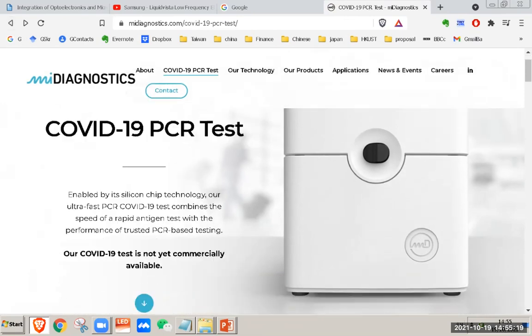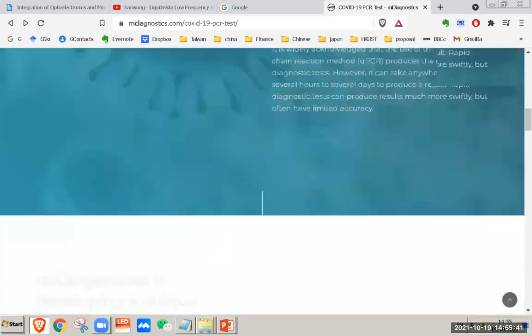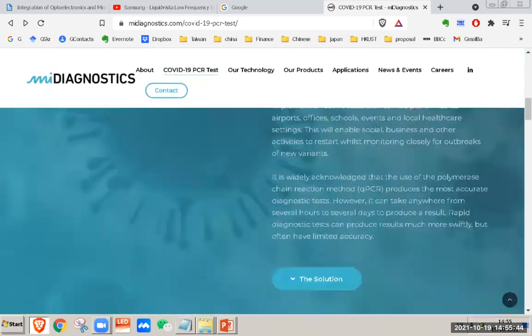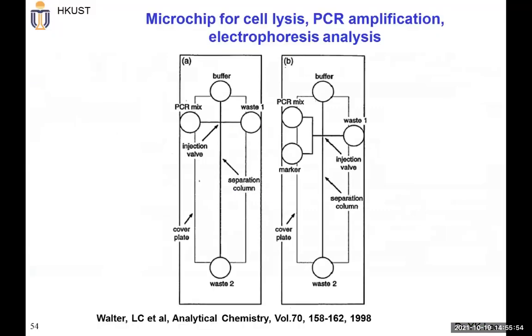so that really makes this kind of silicon-based microfluidic device into a lab on chip, and then they try to demonstrate this kind of system. Of course, it also uses optical detection without any lens, so they show it is possible to use it for COVID-19 testing and a series of other applications. I told you this goes from basic concept to a real product. It really takes a long time, but at least this gives you some idea, right?